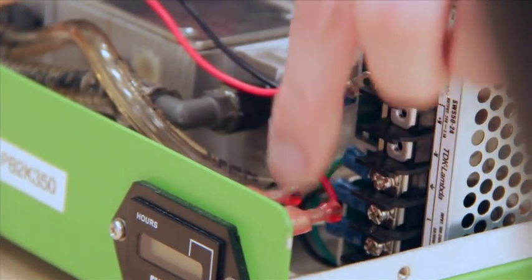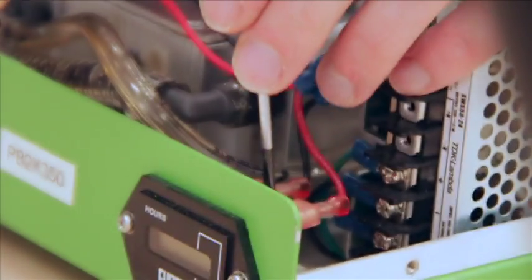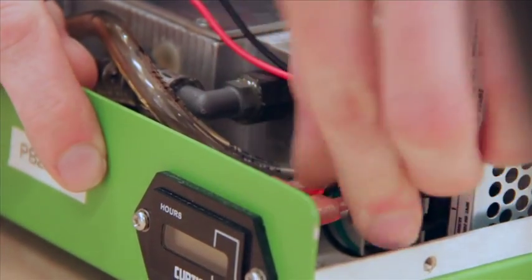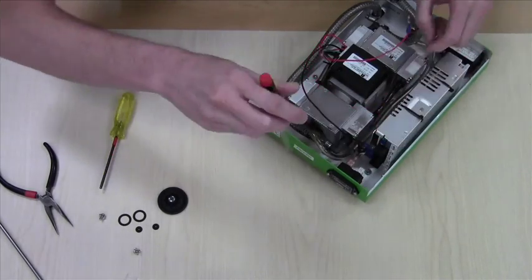Next we'll be removing the two connectors here. We'll simply pull straight back.